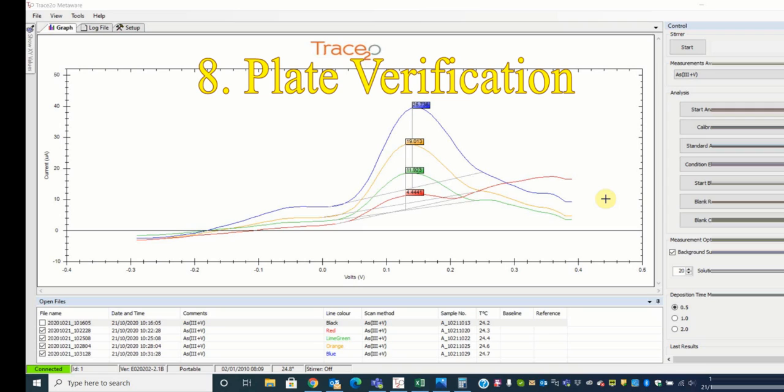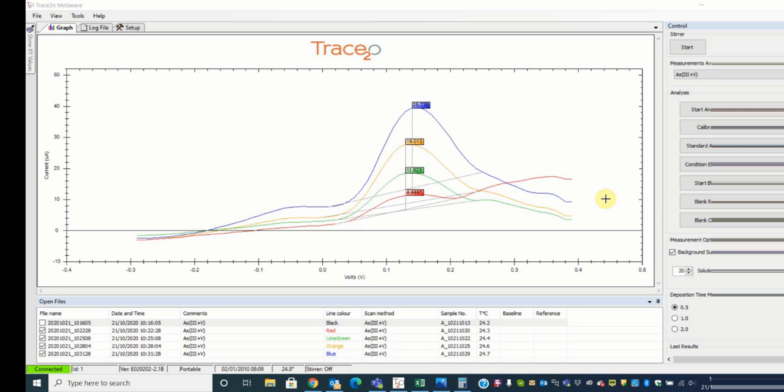With the arsenometer unit, the AU gold plating step is a critical part of the process and forms an integral part of your instrument. However, the AU500 plating step, also known as the M2-3 conditioning step, is not something that can be done within the production facilities and must be done in the field. As a result, a number of things can go wrong with the M2 and 3 conditioning step, and errors during this step will severely affect the results of your analyses.